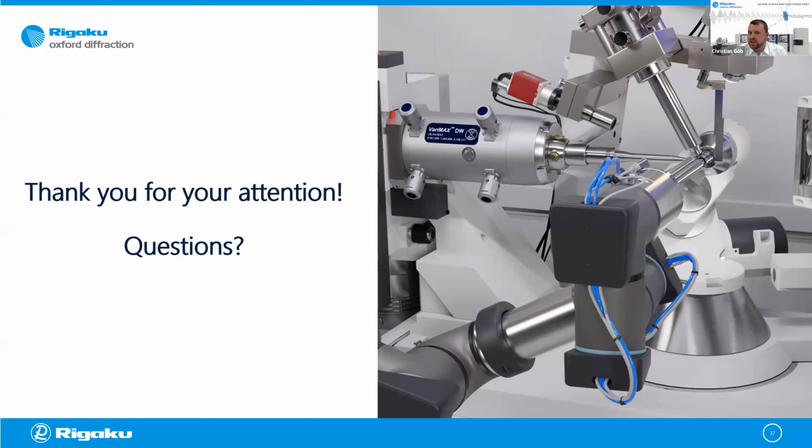And also a good indication that soaking works is that it can go a little bit opaque, so to speak. This means that your analyte molecule degrades the crystalline sponge framework a bit, thus interacts strongly with it. This is also a good starting point to lower the temperature and lower the diffusion rate of this analyte molecule. Okay, thank you. How many soaking iterations would you attempt before deciding that the guest cannot be included?